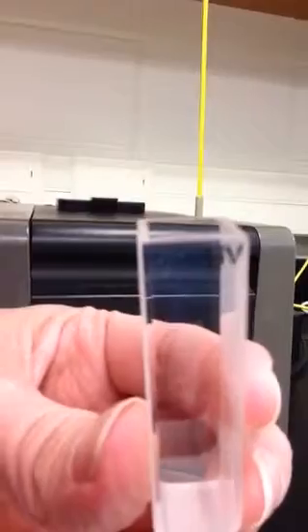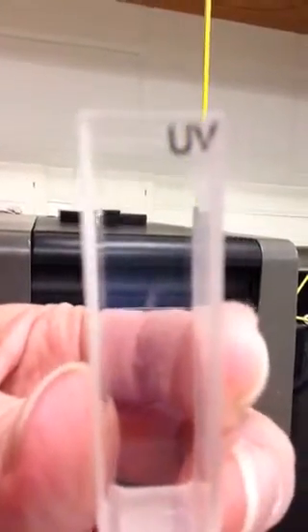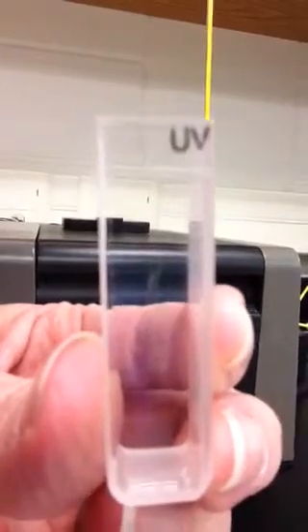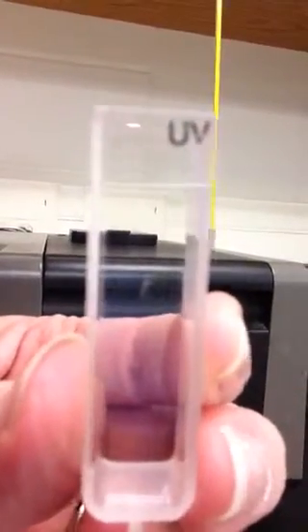This is the sample holder. This is called a cuvette. So a cuvette's just a little square sample holder. And this one is made of quartz, and so it does not absorb in the UV light range. And so we can put samples in it and we don't have to worry about the cuvette having its own personal absorbance. We want that to be for sure.